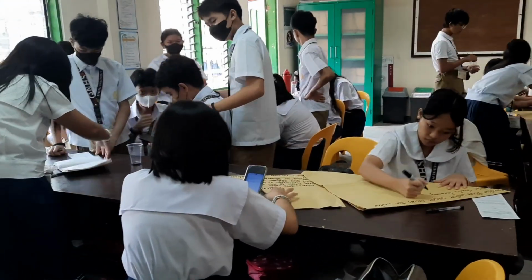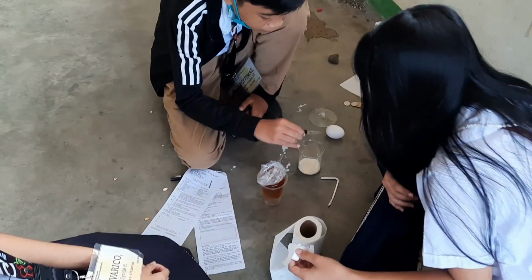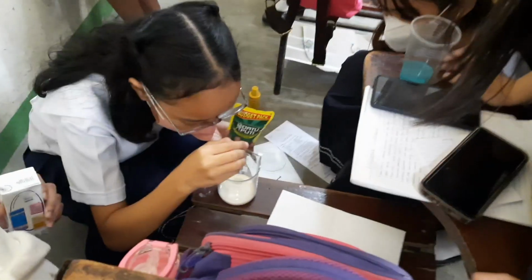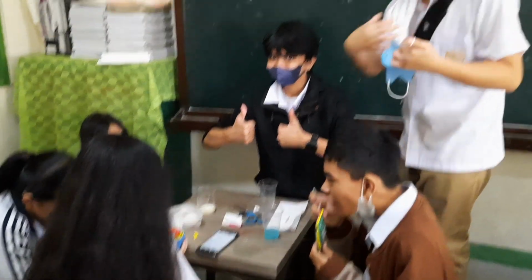For today's activity, we're going to perform an experiment that shows physical versus chemical change. And the objective of this experiment is to differentiate physical from chemical change.